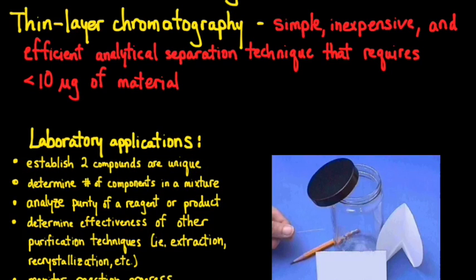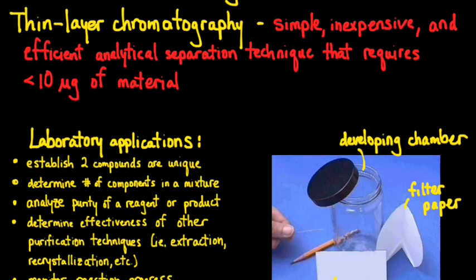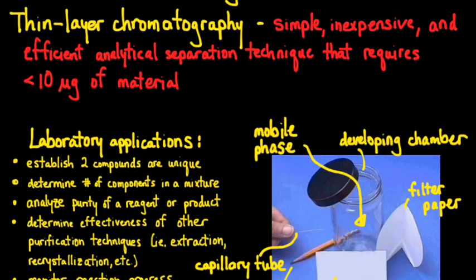The components needed for running thin layer chromatography are quite simple. Some kind of TLC plate is required, shown here is a silica gel TLC plate. A developing chamber, either with a lid or wrapped in foil or plastic wrap, is needed. A small piece of filter paper will be used to wick the solvent throughout the chamber, keeping the vapor pressure even throughout. A pencil is needed to mark the TLC plate, and a capillary tube or micropipette is used to apply the sample compound. Finally, an elution solvent or mobile phase will be placed inside the developing chamber.